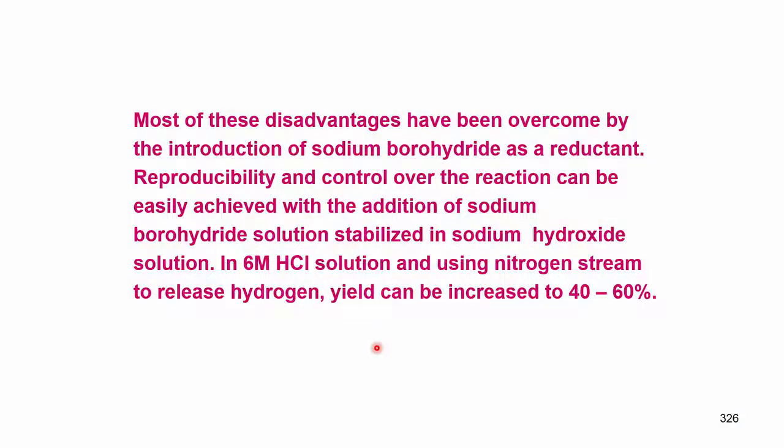Most of these disadvantages have been overcome by the addition of sodium borohydride as a reductant. With sodium borohydride most of these difficulties were overcome, and today it is one of the most accepted techniques for the determination of hydride generating metals, because sodium borohydride is available as a high purity material and also as a tablet.